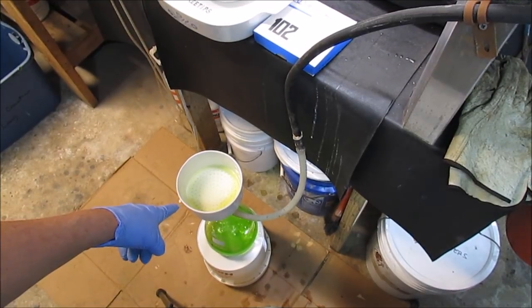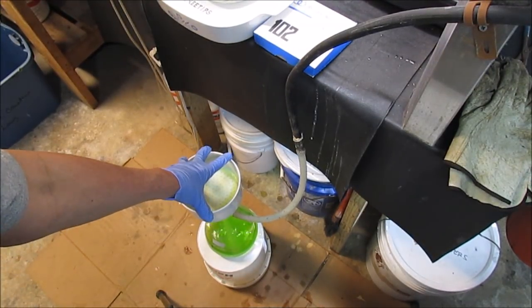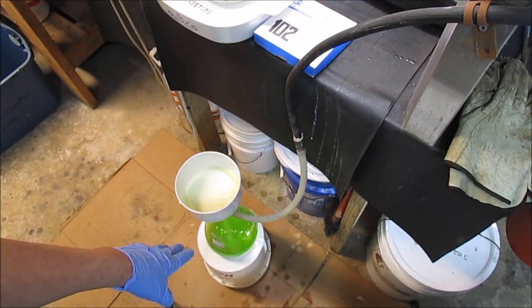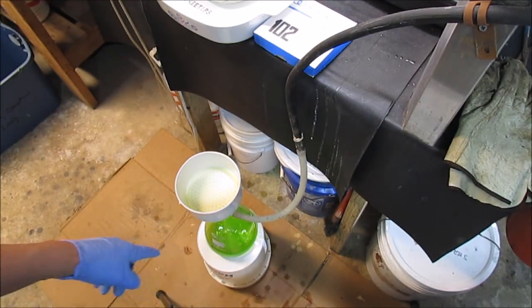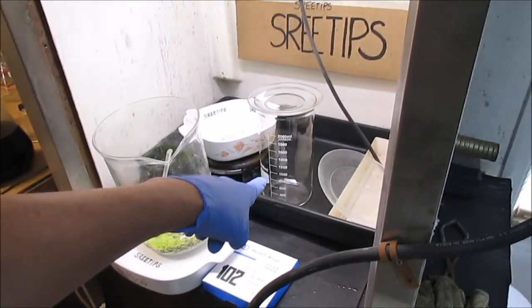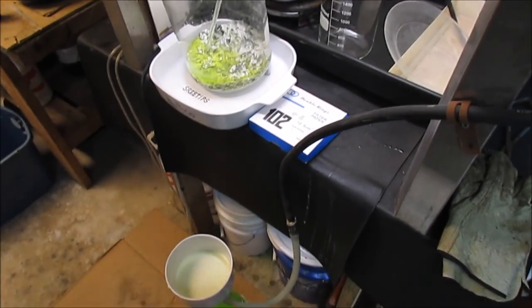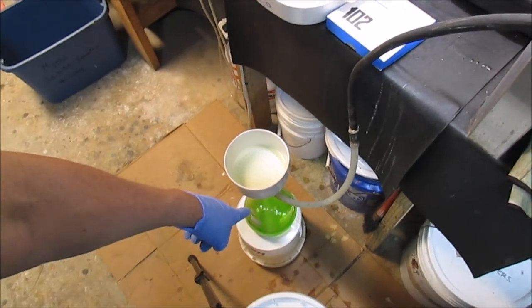Down to the end of the filtering on this, and what I'm going to do is I've got the liquid filtered. I'm going to put it up here in another flask or another beaker, and the reason I'm doing this is because this liquid came through real easy.